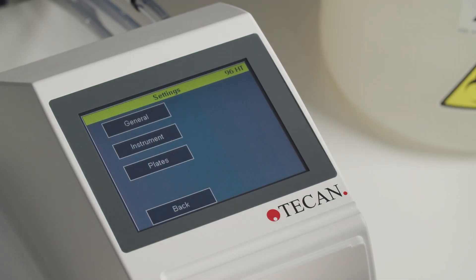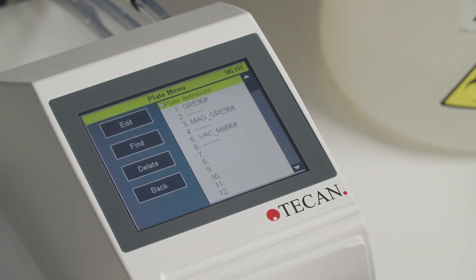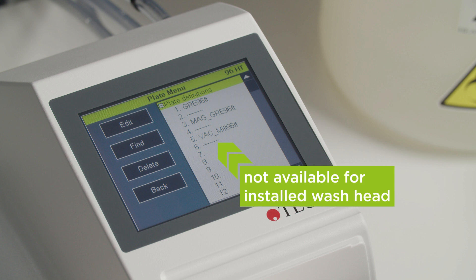Enter the settings and open the plate menu to see all the plate definitions stored on the instrument for the wash head mounted. This line indicates that the microplate is not compatible with the installed wash head.